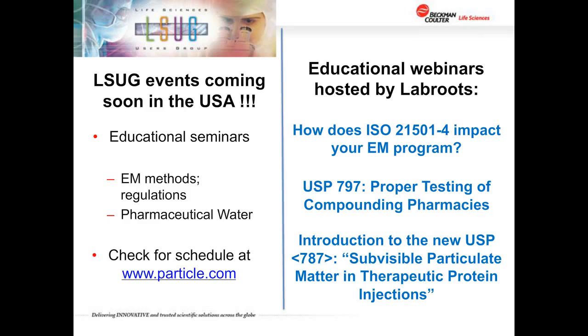So while the audience members are answering the poll, I'll ask the first question, which comes from Mark, who asks, under the new revision, how many counts, how many locations, and for how much time would you sample a safety cabinet work zone that had an internal volume of 0.6 meters cubed?